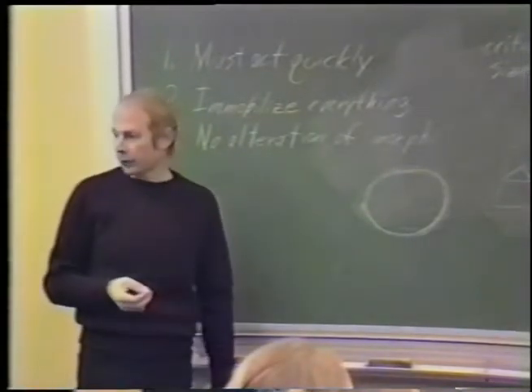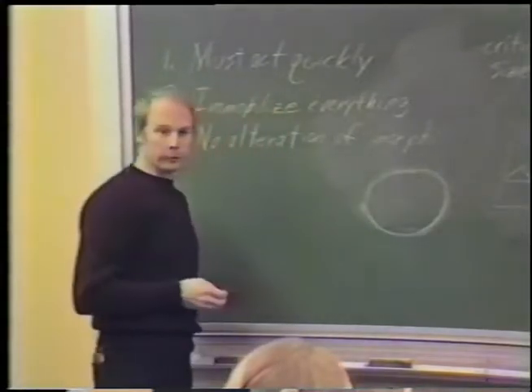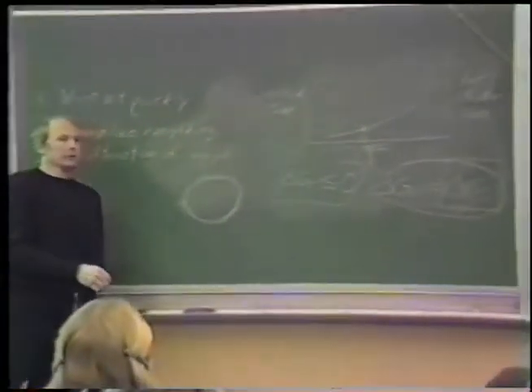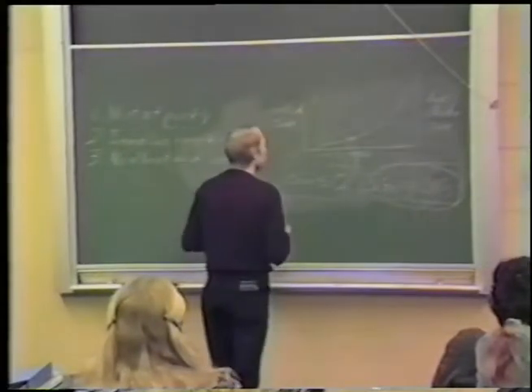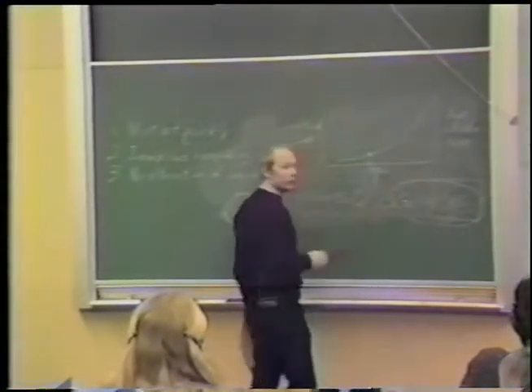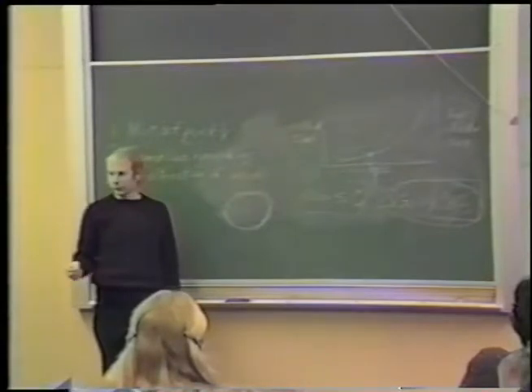Now, it doesn't really matter a lot whether this is a system which can exhibit a spinodal or not. At this temperature, the ice crystals that are formed are going to be very small. What you have to do is get the sample to the temperature of homogeneous nucleation as quickly as possible so you have a maximum density of ice crystal nuclei.